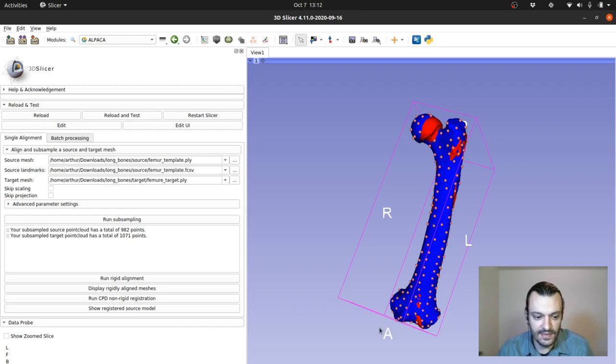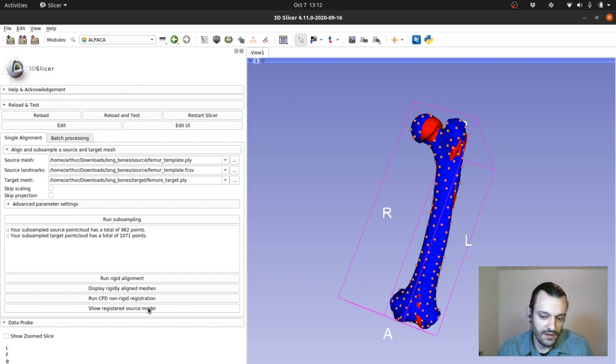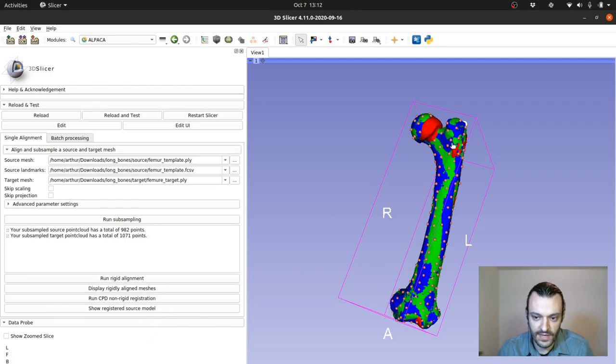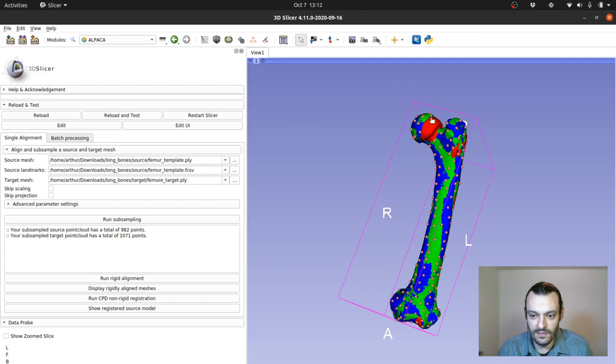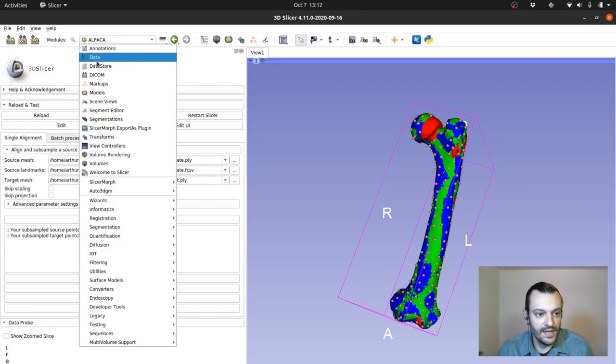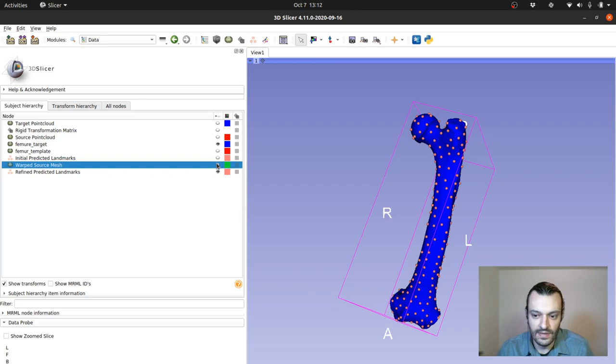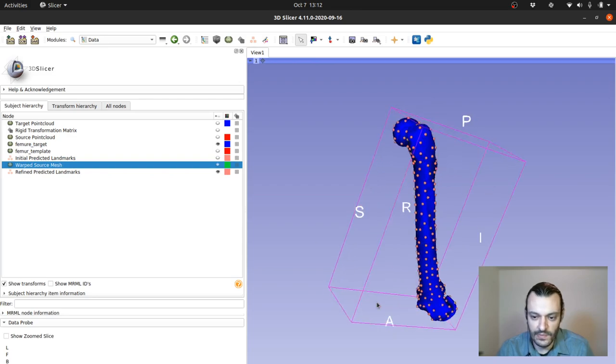And then you can see the pipeline has finished and you can opt to also show the deformed source model in green. You can see basically the green model represents the red model after the deformation and you can hide all of that and just keep your target mesh.